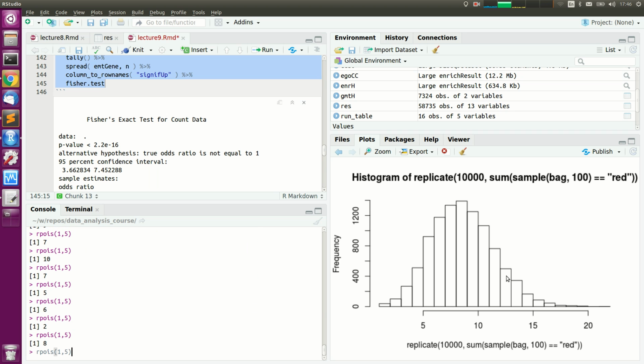This would now be the following experiment. I have one prepared library, and I take many aliquots and put each of them on a different lane of my flow cell. And even though I know that the concentration of this gene is exactly the same in each flow cell lane, because after all I took aliquots and I mixed well and shaken well before I did it, still I sometimes get 3 reads, sometimes I get 5 reads, and so on.